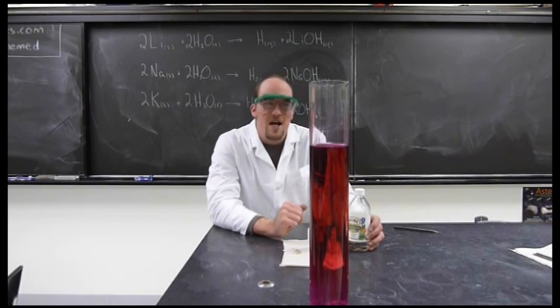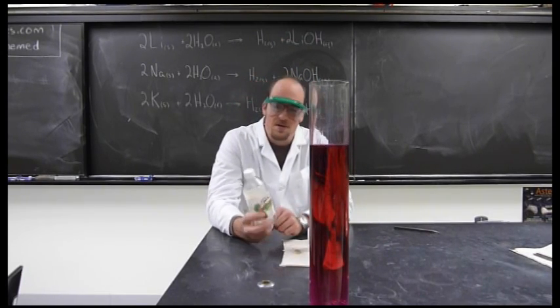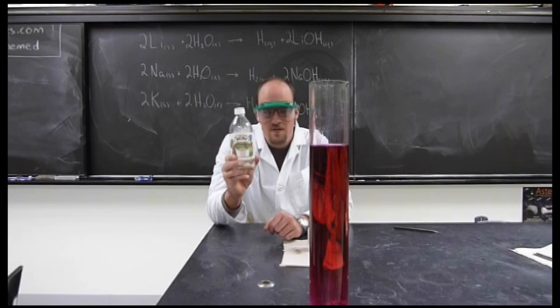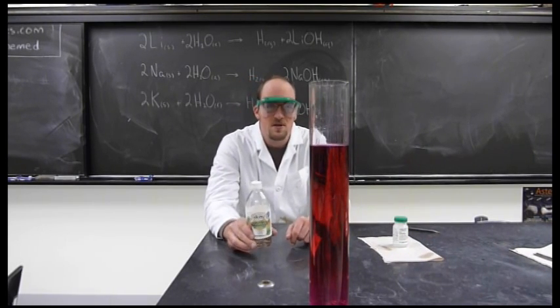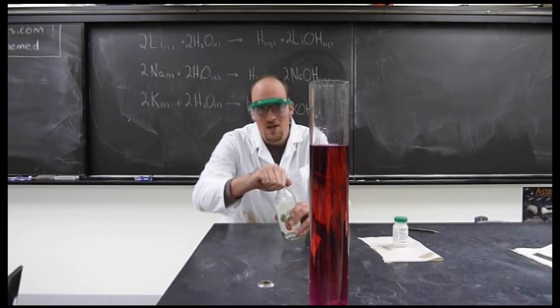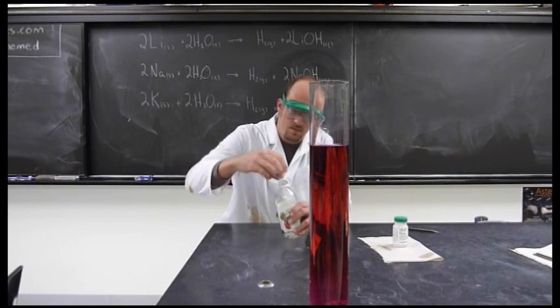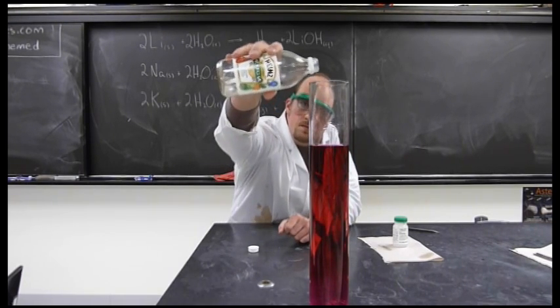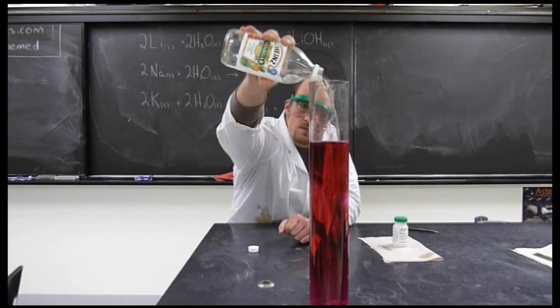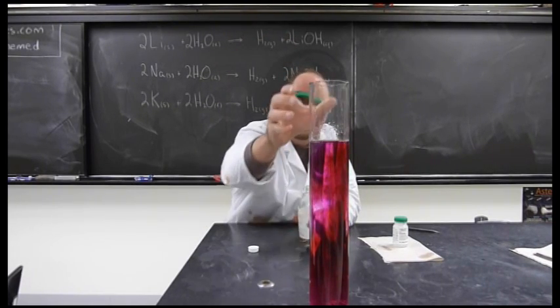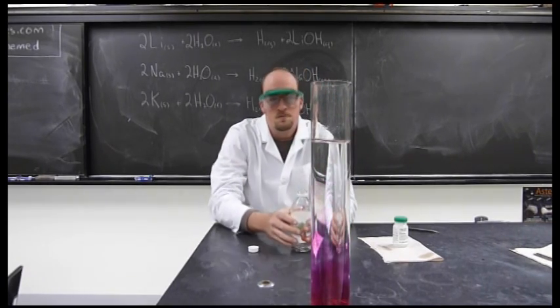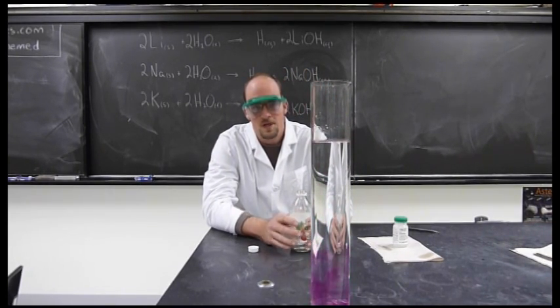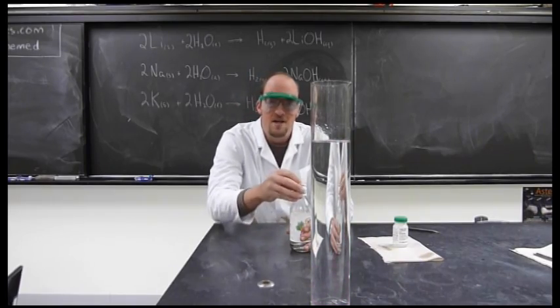So it makes sense then, if I added something acidic back to the solution, like vinegar, enough to completely react with all of the base that's in the solution, it should go back to being colorless. And, as you can see, it does.